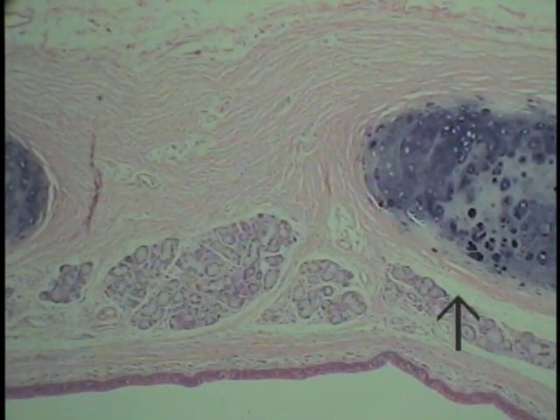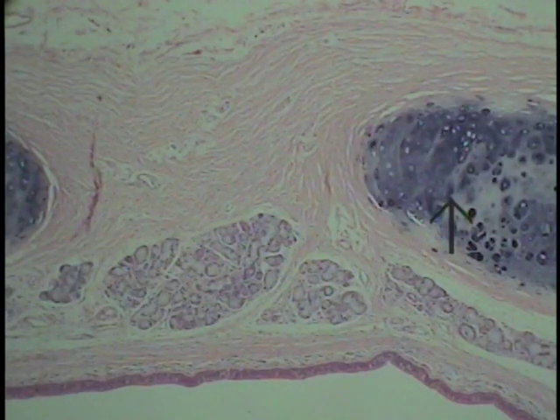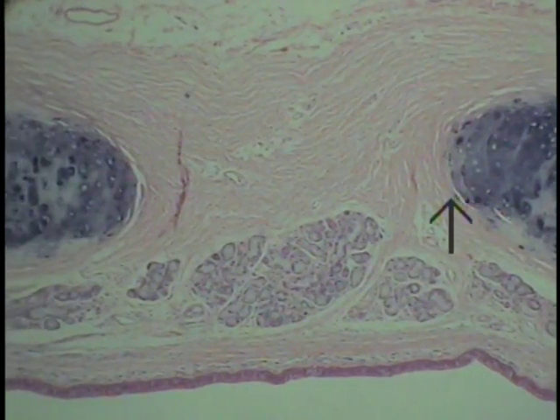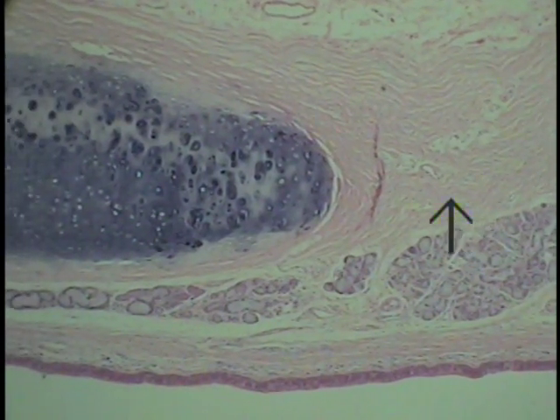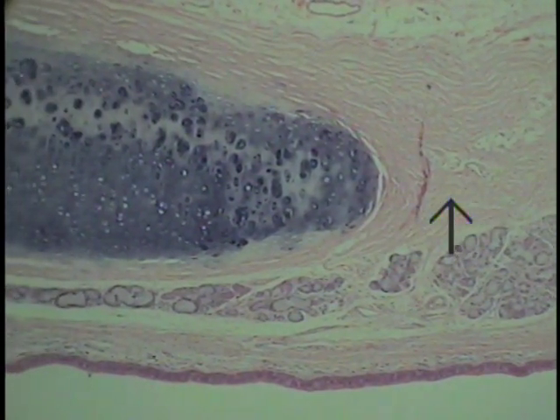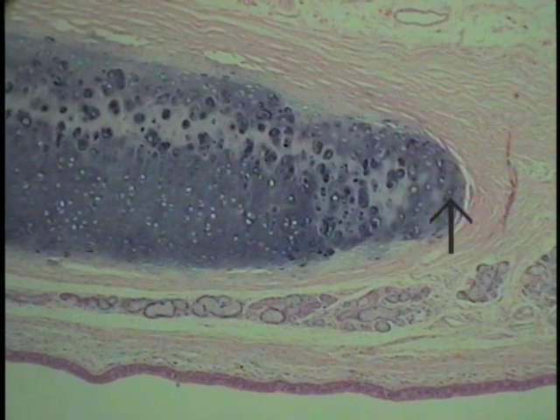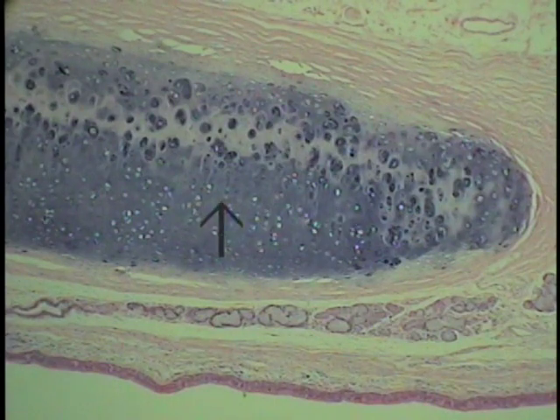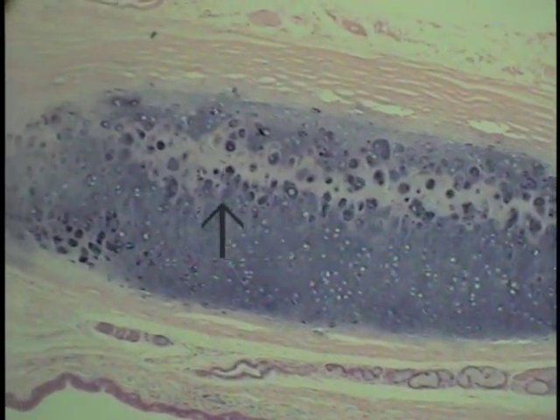This particular field represents a section of trachea. What characterizes the trachea are the large cartilage plates, or these U-shaped cartilages that form around the exterior wall of the trachea that help maintain its patency due to the extreme pressure changes during inspiration and expiration. So this is a longitudinal cut through the long axis of the trachea. Another cartilaginous ring cut crossways is coming into the field of view and is shown in the center of the field where the arrow now resides.